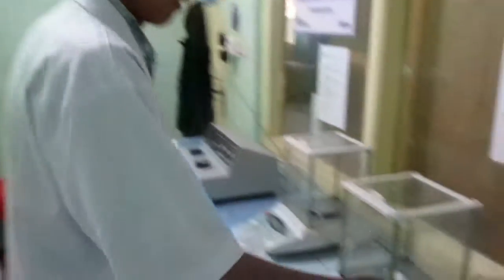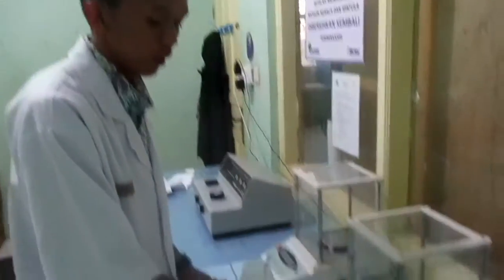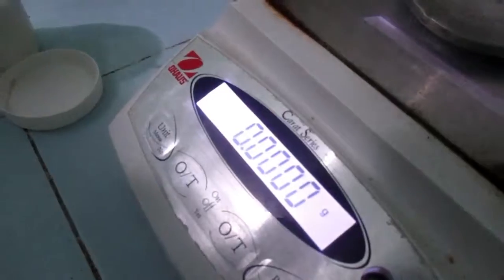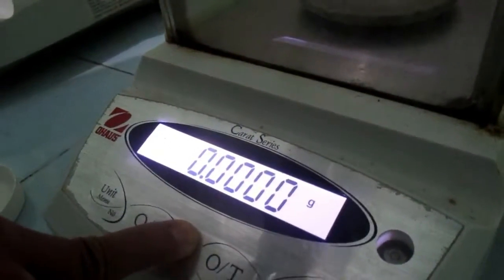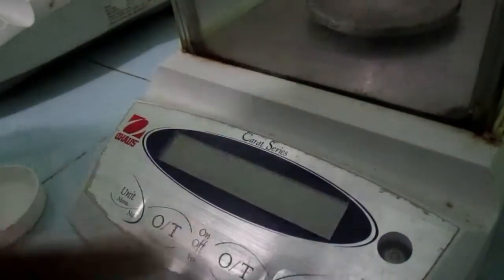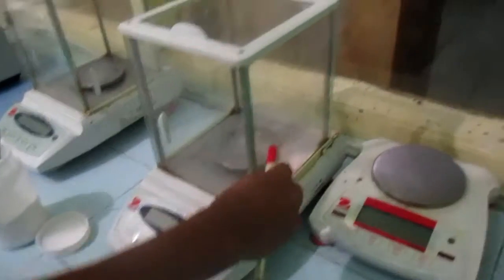Write the result in your notebook. After getting the result, remove the watch glass and the chemical solid and place them on the table. Close the glass door and press the tare button. Then turn off the analytical balance by pressing the button.